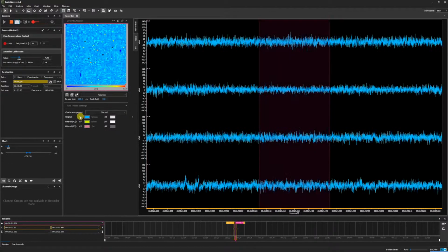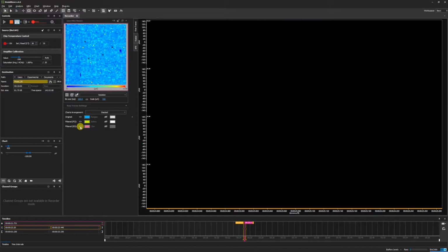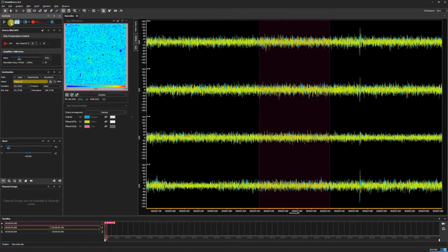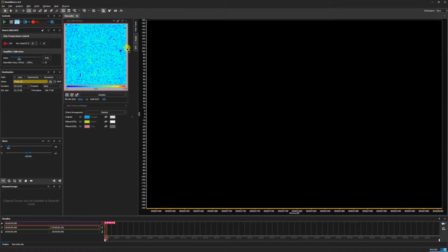As we have seen in our offline data filtering video, the fast oscillation and slow oscillation filters are ideal to enable more accurate LFP and spike detection. Enabling these filters in online mode allows us to visualize our data and have an idea of how our analyses will turn out. Please see the video resources linked in the video description for more information.